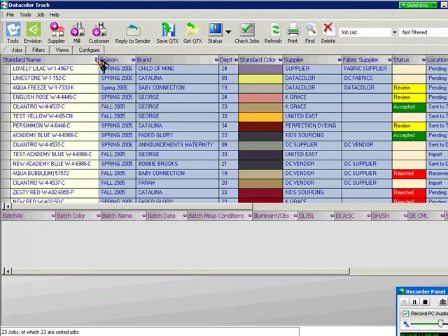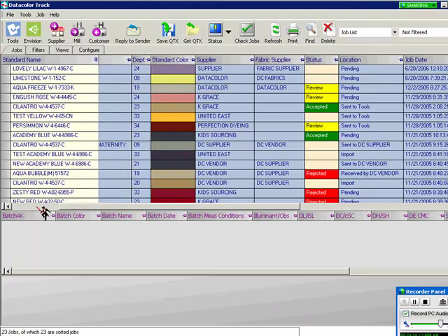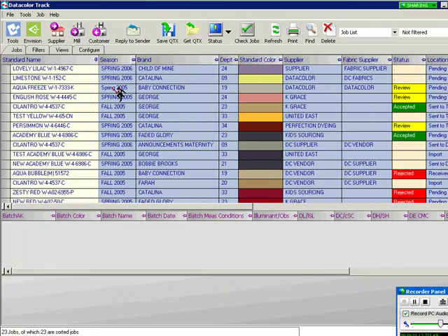If we click on that, that push pin goes from pointing left to pointing down. That means that this column has now been pinned into place. So as I scroll from left to right, that particular column stays in place. And we can pin multiple columns if we like so that we can scroll back and forth. Okay. I'll just go back and undo that for this moment.